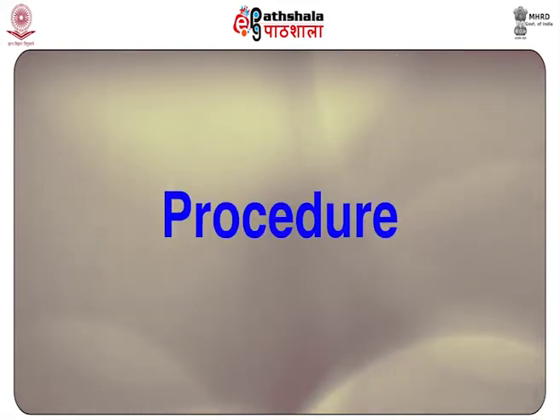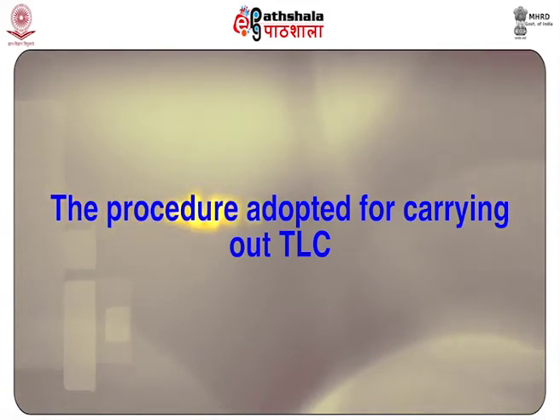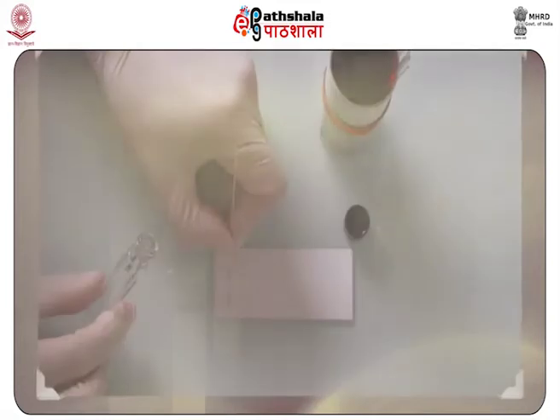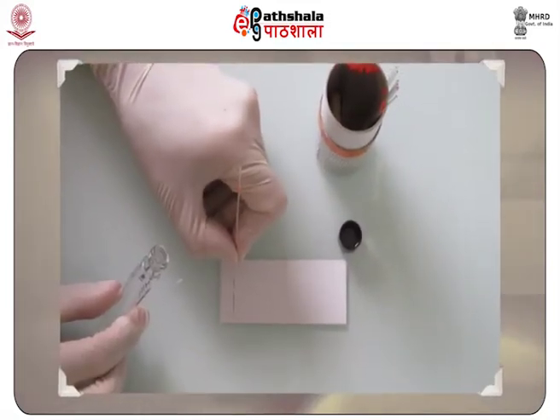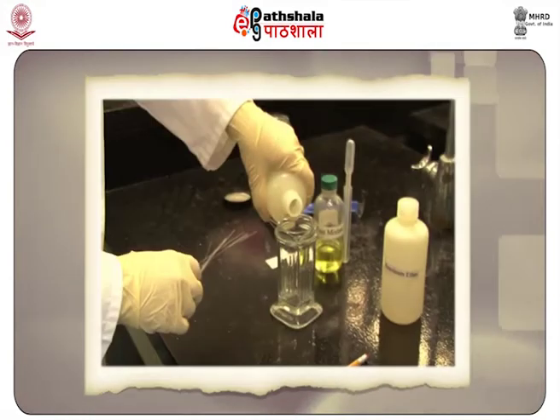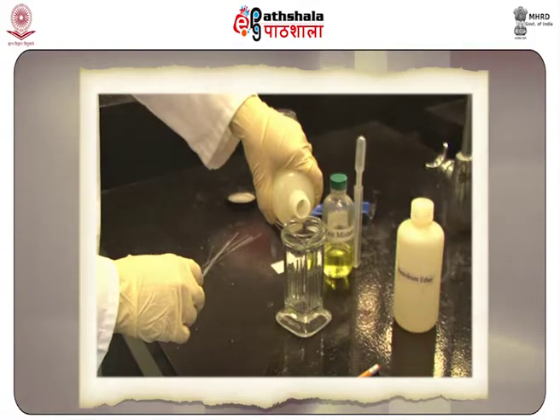Now, the procedure. The procedure adopted for carrying out TLC is as follows. About 1.5 centimeters from the bottom edge, a small spot of the sample under analysis is applied. A mobile phase in appropriate amount is taken into a glass beaker.